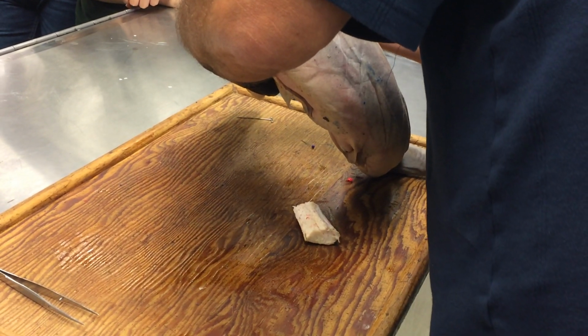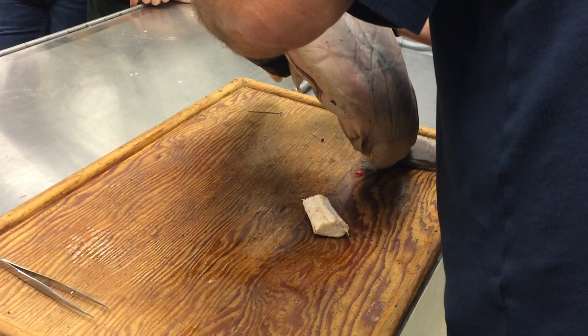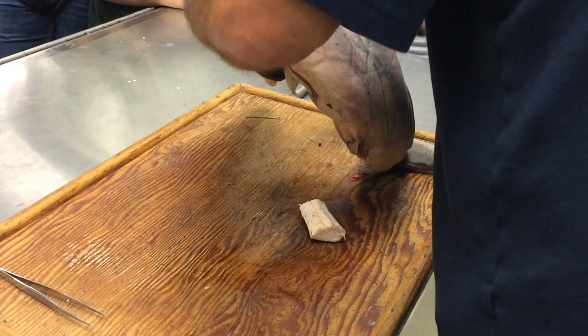You guys, there's pharyngobranchials, and these are the dorsal interarcuals. That's actually the cartilage, right? Right there. Yeah. Sure. Yeah, you can see it.